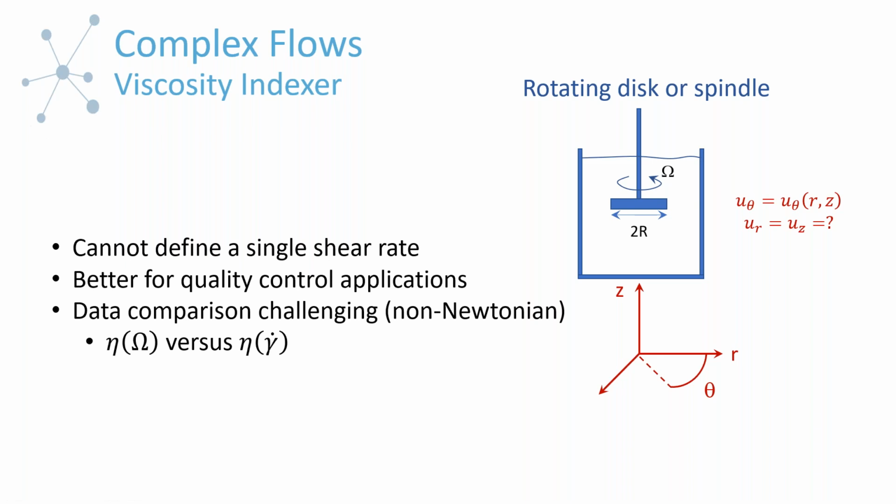I drew the disc, but you can find something that looks more like a cylinder. You can have a vane. There are many options, depending on the industry and the samples you work with. One thing you'll notice is that I didn't draw a well-defined flow field or velocity profile as I did in the other geometries, because that's difficult to do in this situation.